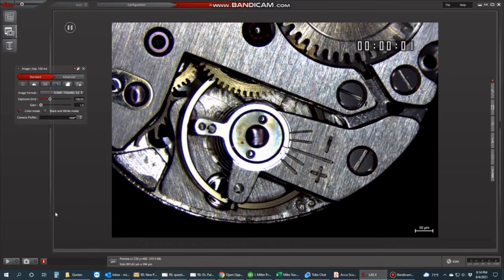So again, pause the live image, and here on our right hand side are our annotation tools for adding a text box. The first thing I want to explain is the individual overlays. In order to activate this software how you would like it, we want to click this icon and click this rubber stamp. You'll notice when I do that, this rubber stamp icon shows up here. That's our merge feature. I'll explain that further in a second.